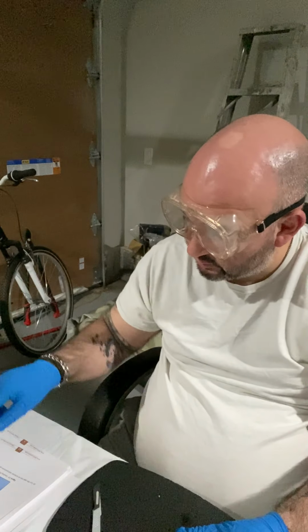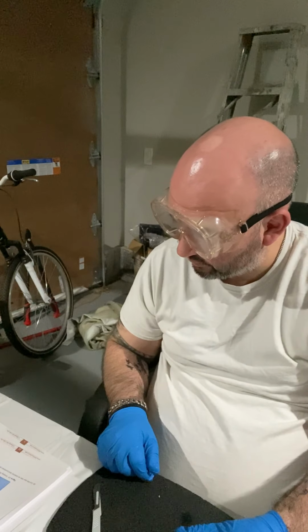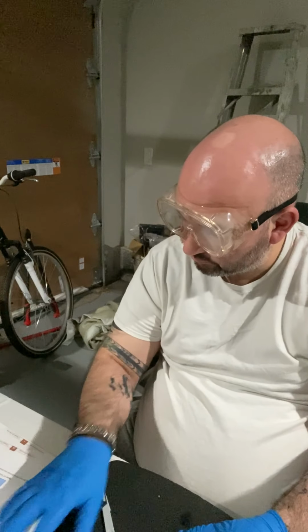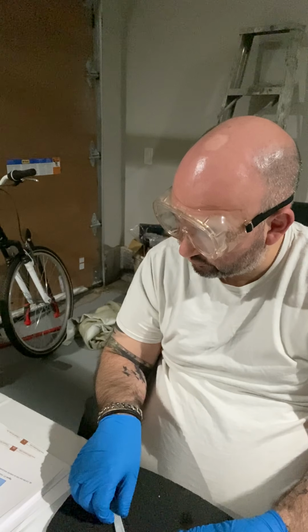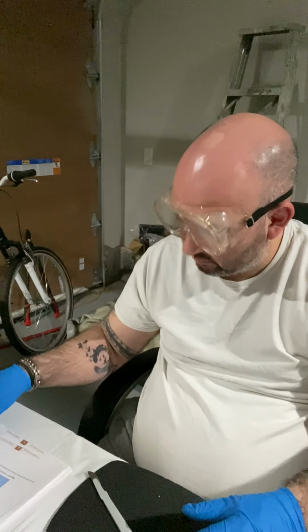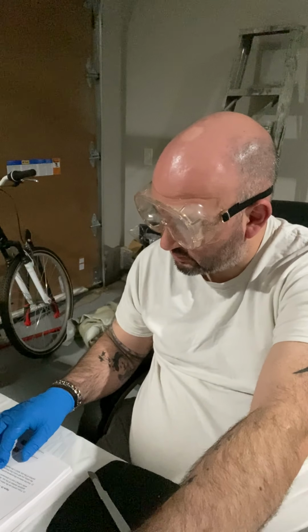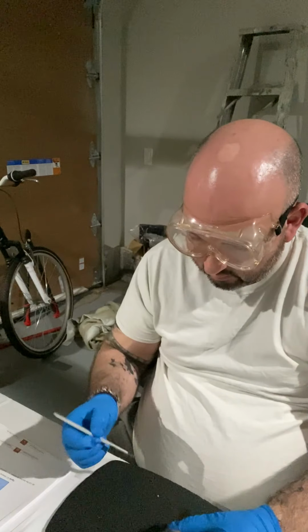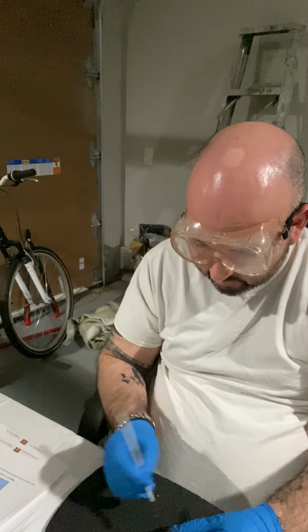All right, so from here, let's see. I went ahead and made my cuts, and I'm just going to cut a bit further in.